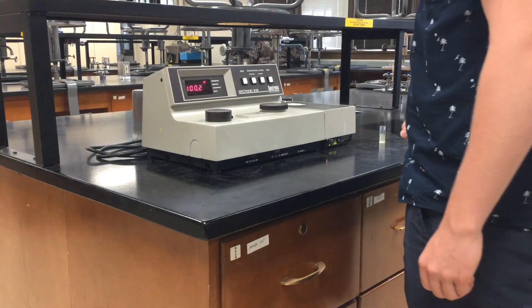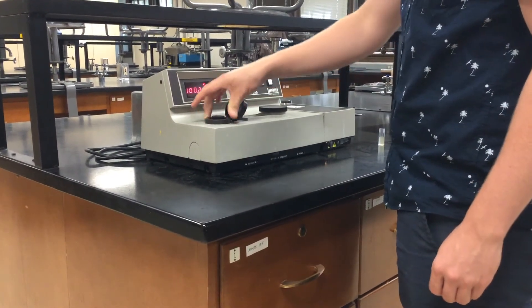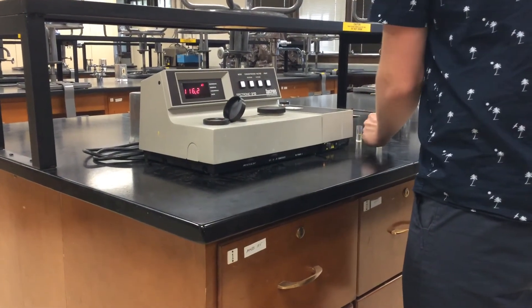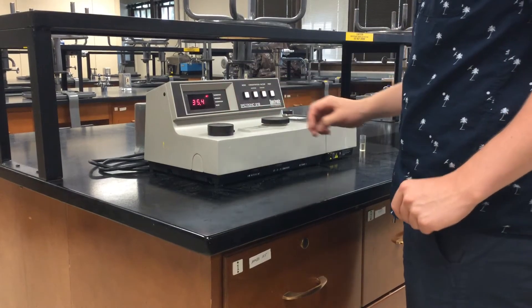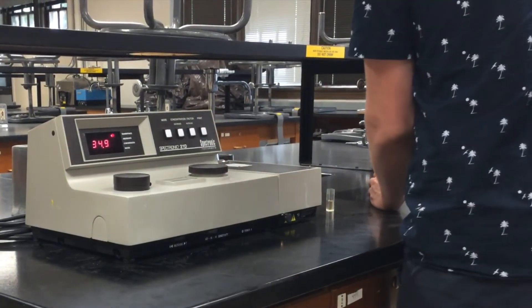Press the mode button again to read the transmittance. Then remove the blank cuvette from the machine and replace it with the cuvette containing the solution that you wish to read. Record the transmittance reading in your lab notebook.